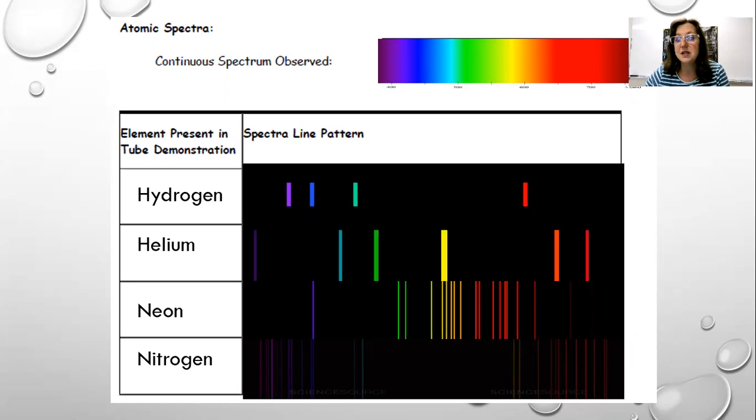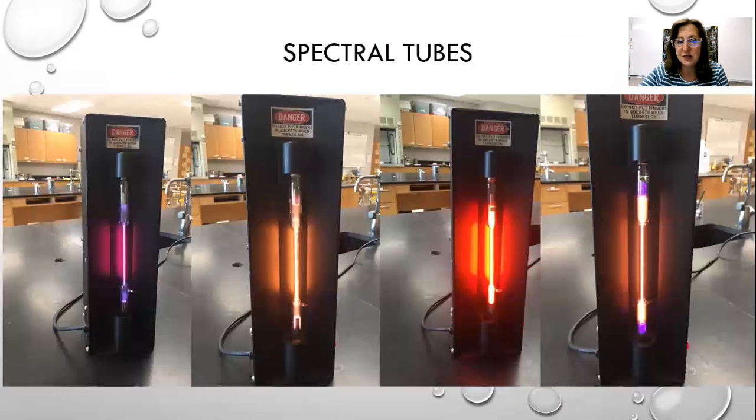Or of course, the last case would be maybe a verbal description of those colors as they transition one to the other. All right, so then what we would do is we would look at our spectral tubes and we would look at them through our spectral glasses, and that breaks the light that we see. So back here we saw the light all mixed.